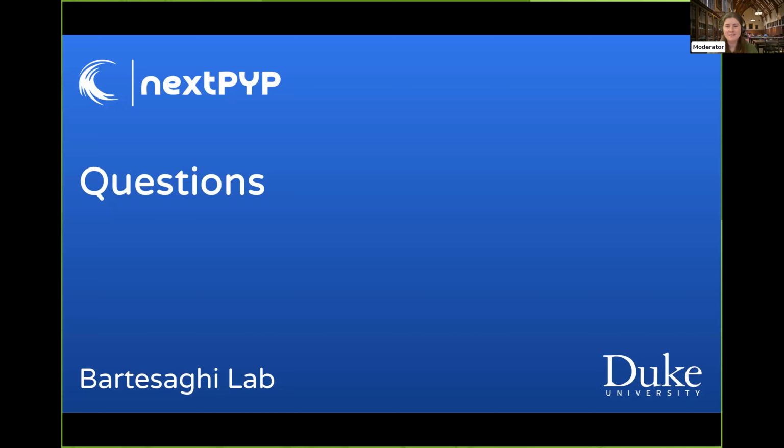All right, thanks, Jeff. So we have a couple questions for you. The first one is someone is wondering if you can run jobs from two different projects at the same time. I believe you can. The running queue is per, okay. Did you say per jobs or per projects? Per projects. How many if you can run two projects at the same time? Yeah. So within one project, each job runs sequentially, like I said. But if you have two different projects, they can run in parallel.